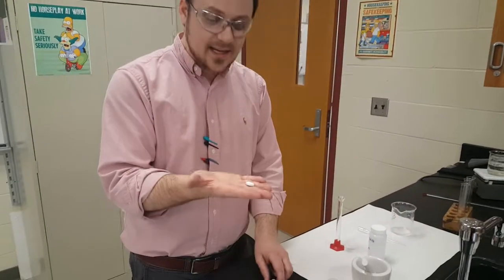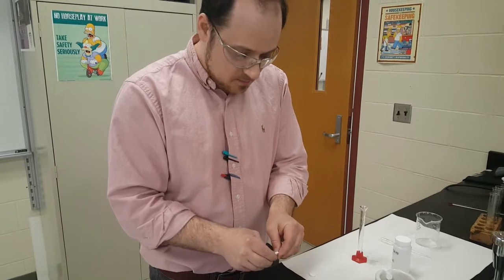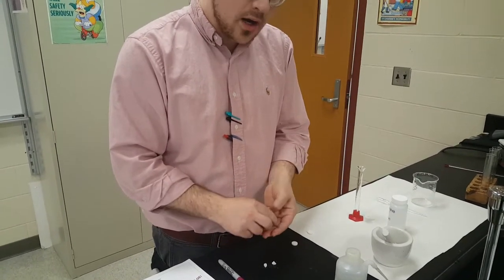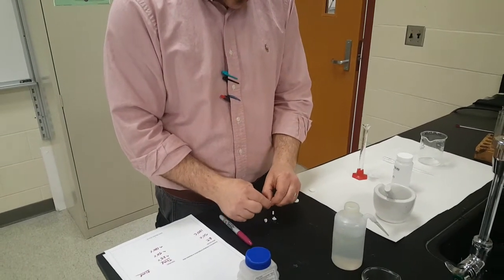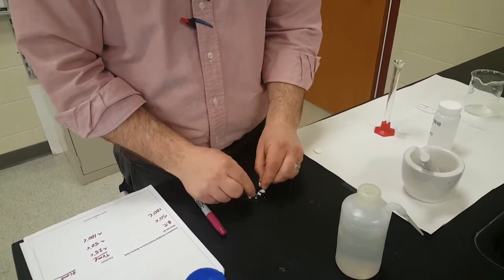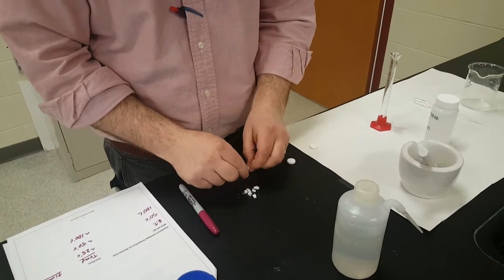Okay. Rinse it out. Start the second procedure. Take that second tablet you got and break it up with your fingers. Break it up into pieces. So we want some chunks. We want chunks. We do not want a powder yet. So we'd like quarters, eighths, maybe 16ths here. Yeah, seriously, don't mess up your new nails. These are the type of chunks we want. We don't want it much smaller than this.